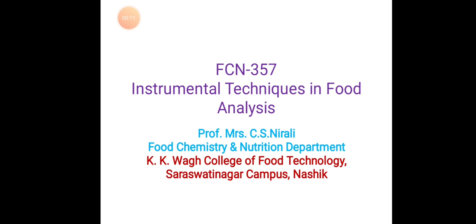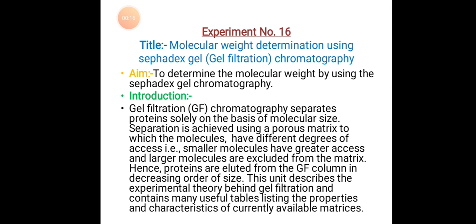Under course number FCN 357, course title Instrumental Techniques in Food Analysis. Today we will see experiment number 16, titled Molecular Weight Determination using Sephadex Gel Filtration Chromatography. Aim: to determine the molecular weight by using Sephadex gel chromatography.